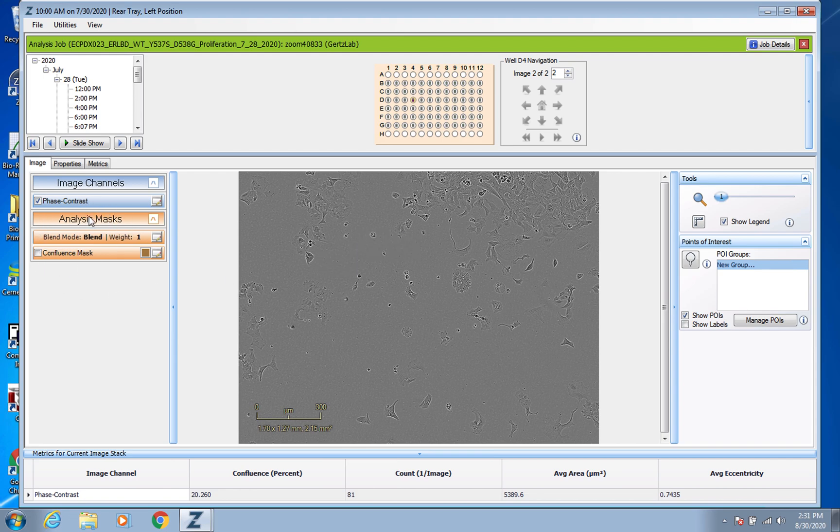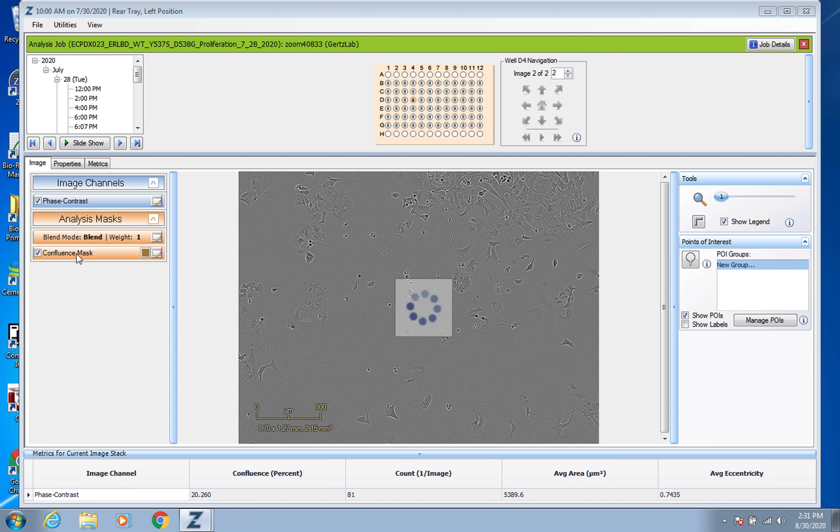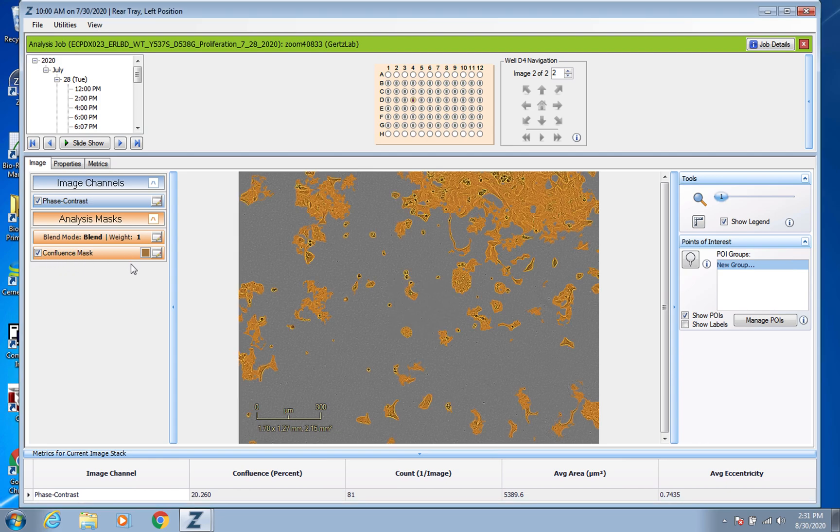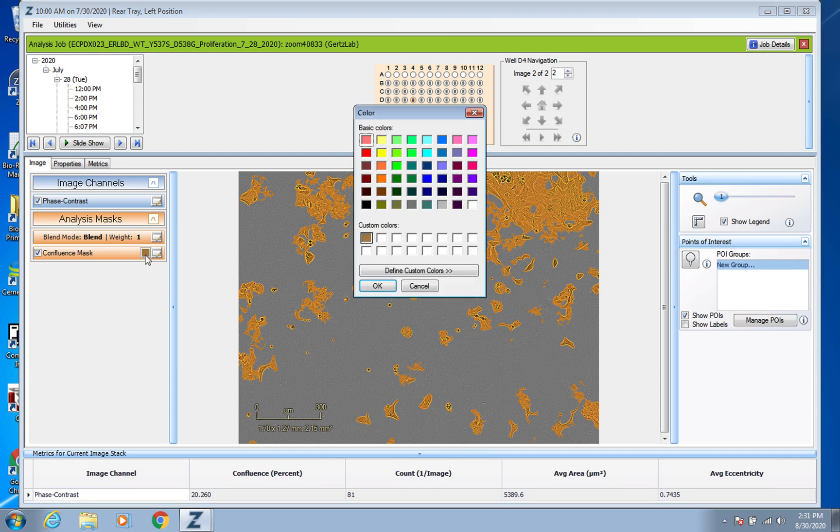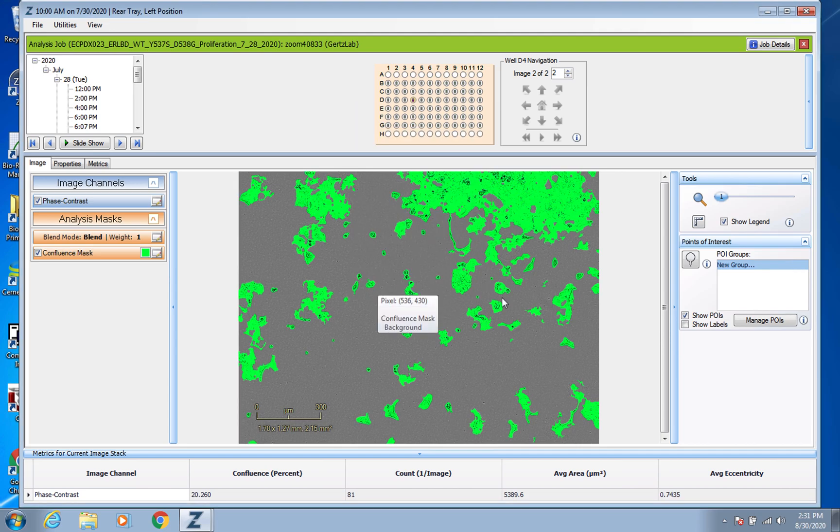And so you'll know you're in it because you'll have an analysis mask over here. So if you clicked on that confluence mask because it's proliferation data, it'll show up like this and you can see that it's doing a pretty good job. You can even change the colors if you wanted to.